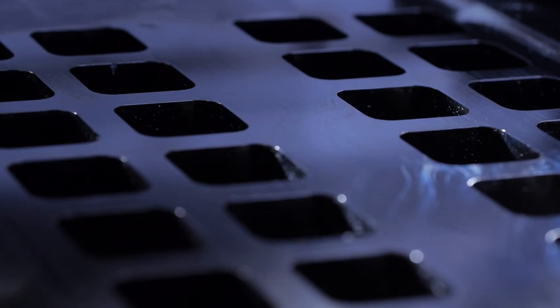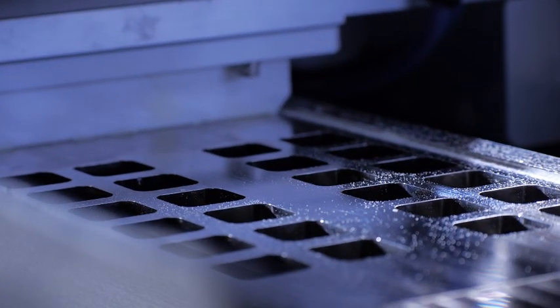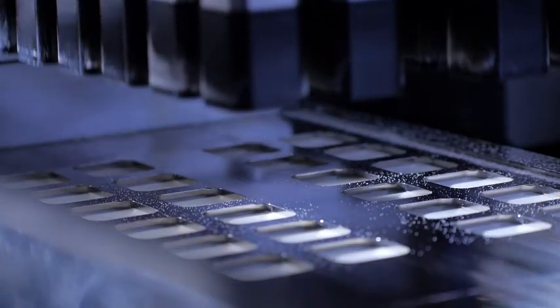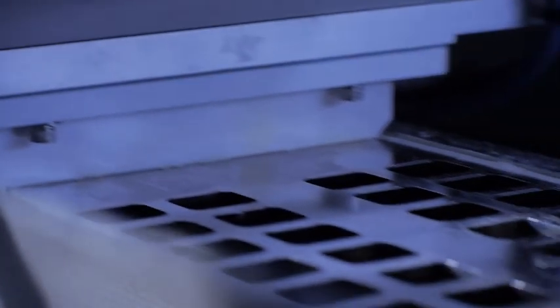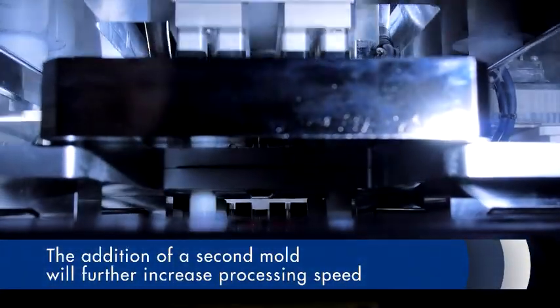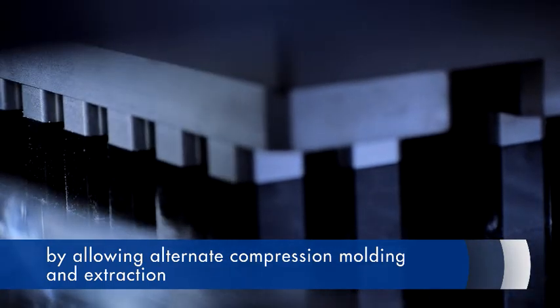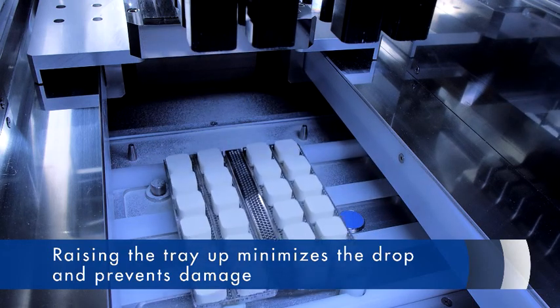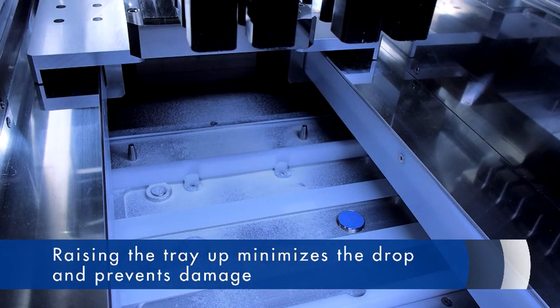First, the bottom is formed by the lower punch. After that, a powder supply unit with an internal agitator moves back and forth to uniformly fill the mold with powder. The upper punch is lowered to compress the powder in the mold, and the movement of both the upper and lower punch can be freely adjusted. The addition of a second mold will further increase processing speed by allowing alternate compression molding and extraction. The hardened molding is gently lowered by the extraction punch onto a tray raised up under the mold to minimize the drop and prevent damage.